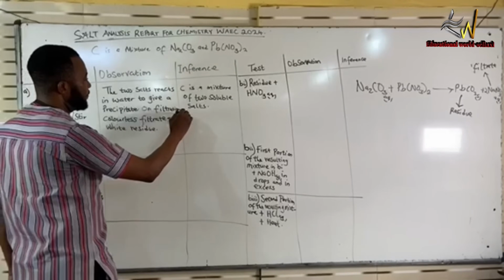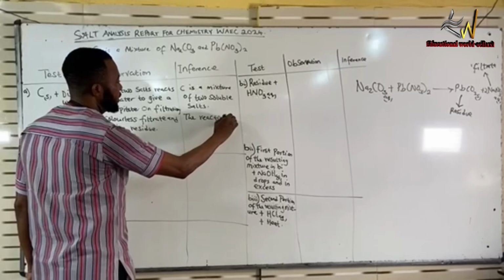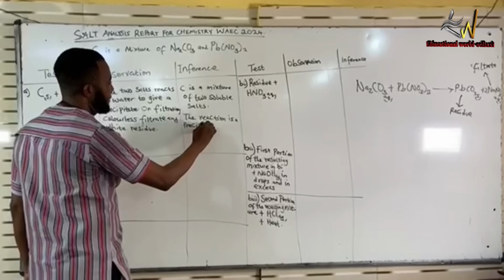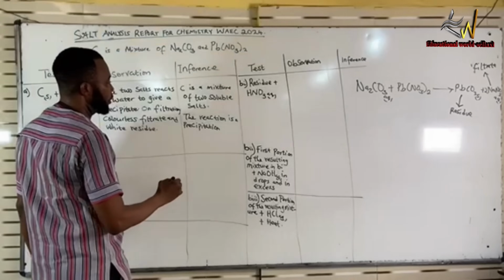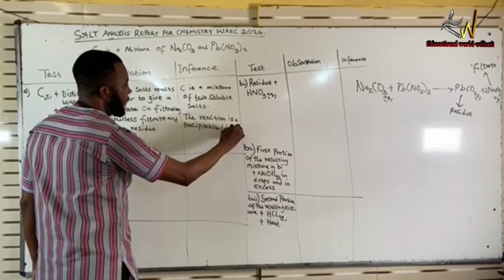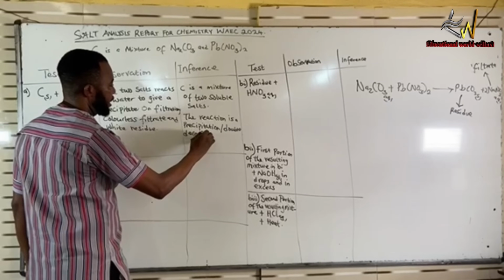So you come to the inference: the reaction is a precipitation reaction, or you say double decomposition reaction.